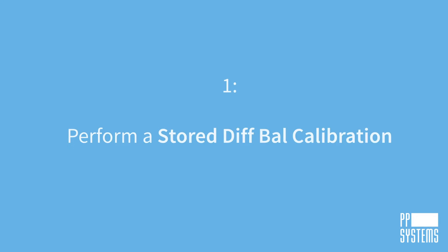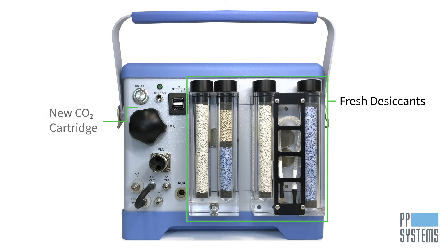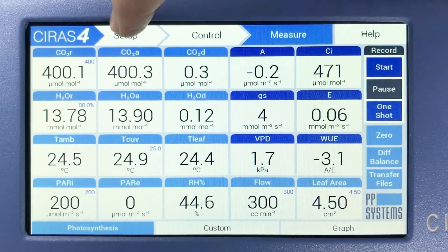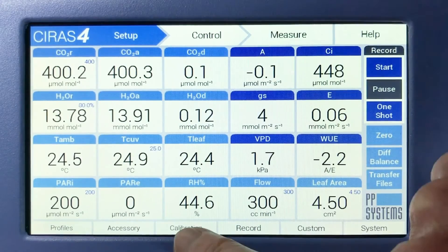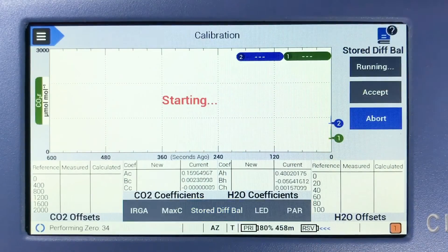We begin by performing a stored DIF-BAL calibration to allow the CIRIS-4 to have accurate offset information applied continuously throughout the linear ramp. Install fresh desiccants and a new CO2 cartridge in the CIRIS-4 and allow it to warm up for 30 minutes. Navigate to Setup, Calibration, Stored DIF-BAL, and tap Start.